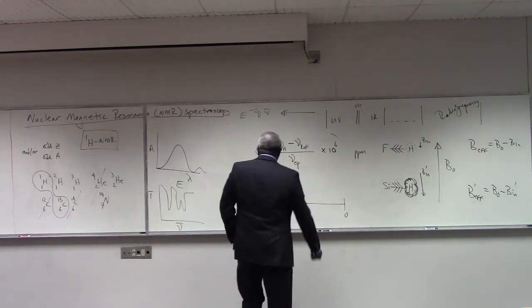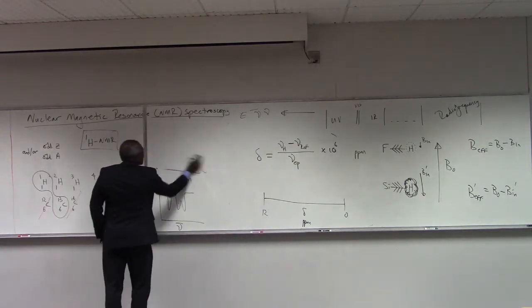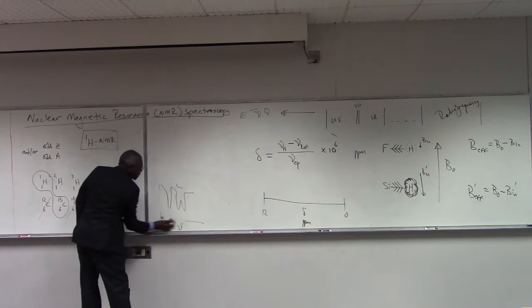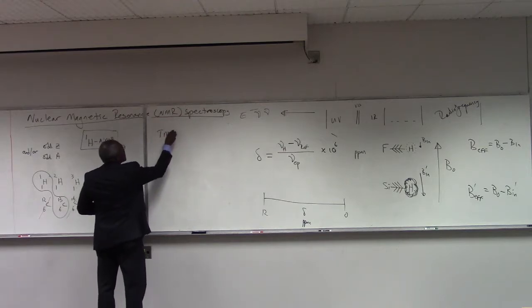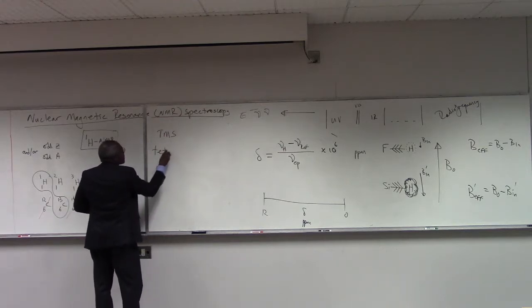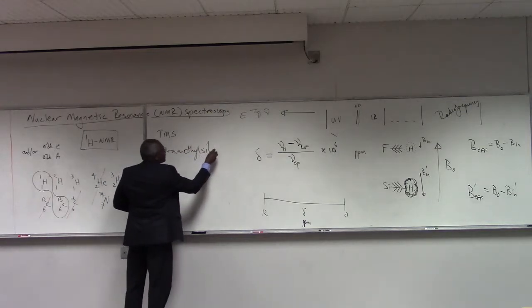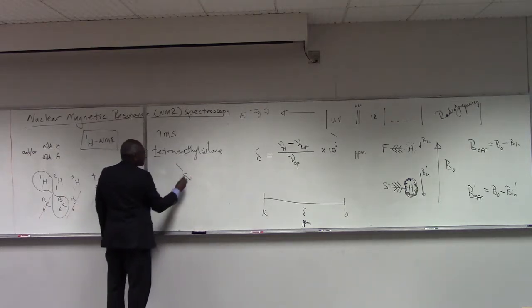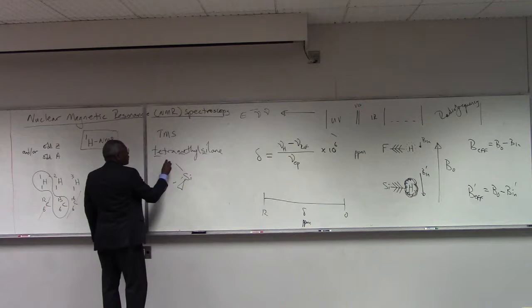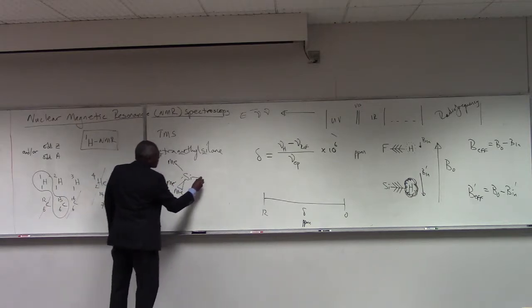So let's talk a little bit about what the reference is. We will not dwell too much on it. And the reference that we use for most organic compounds is something called TMS, which is tetramethylsilane. Right? So TMS. So that's silicon with 4 methyl groups.